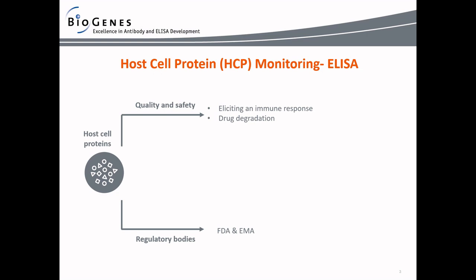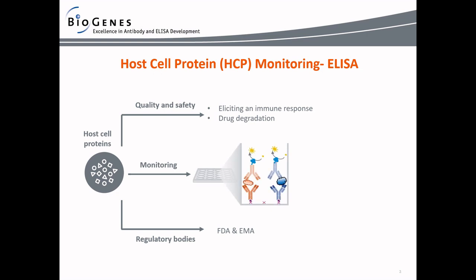The EMA and FDA, as the two major regulatory bodies, have released a set of guidelines that are constantly updated and that ensure high levels of patient safety during the clinical trials. In general, the market authorization requires a profound overall assessment of potential high risk and benefits. Therefore, an accurate detection of HCP impurities is necessary. And the enzyme-linked immunosorbent assay, short ELISA, is still considered the gold standard for HCP measurement, having advantages like high sensitivity, speed, and high throughput.